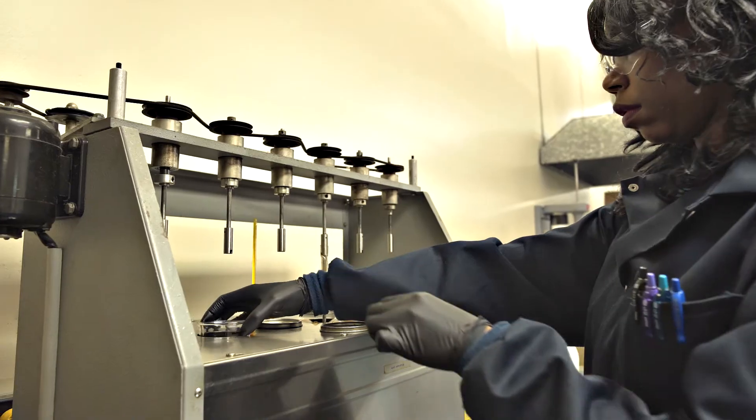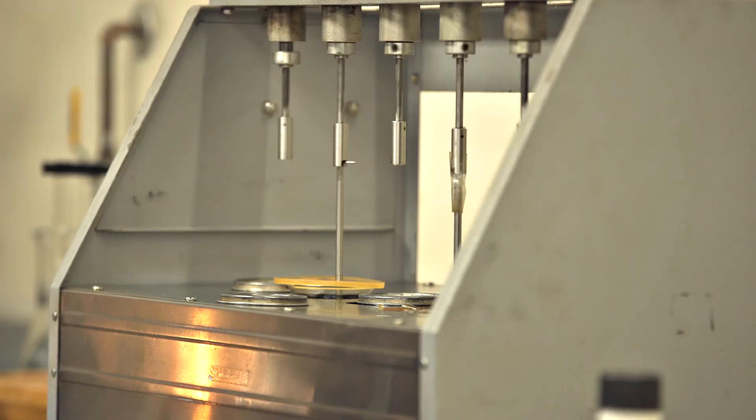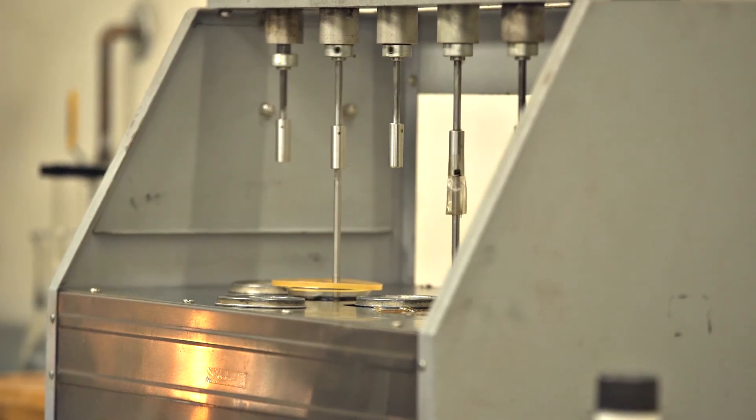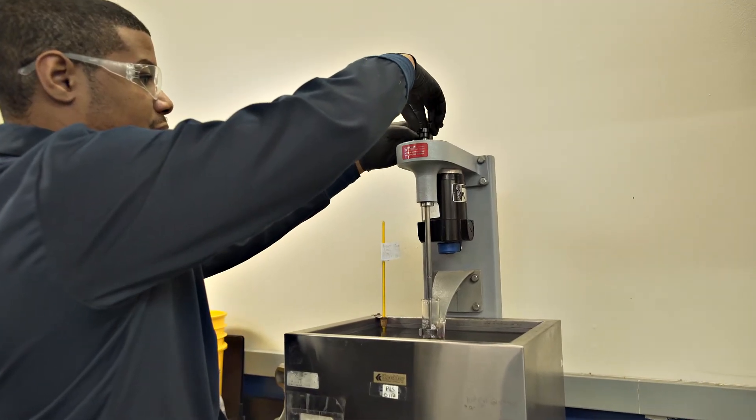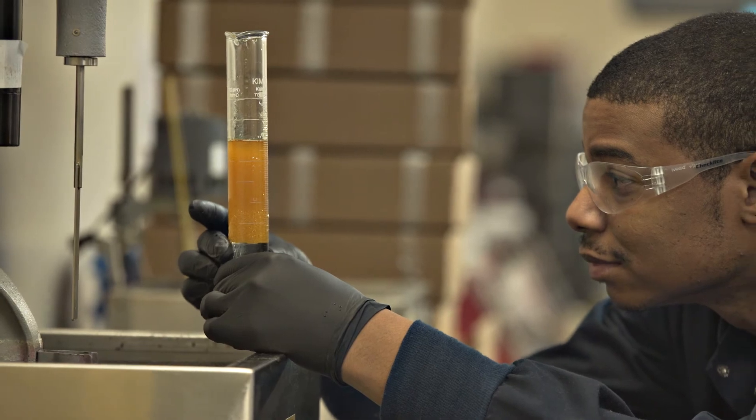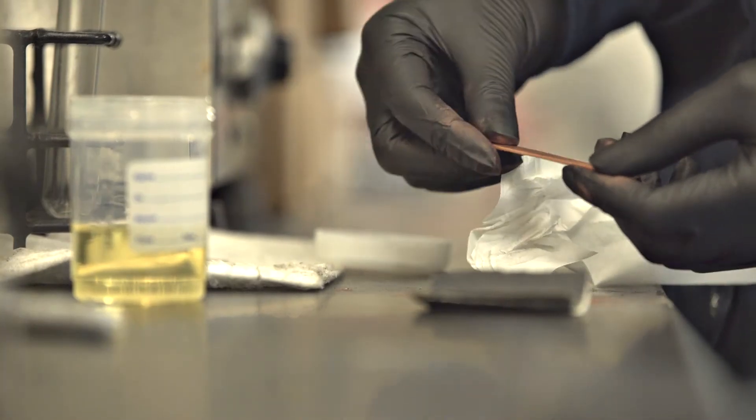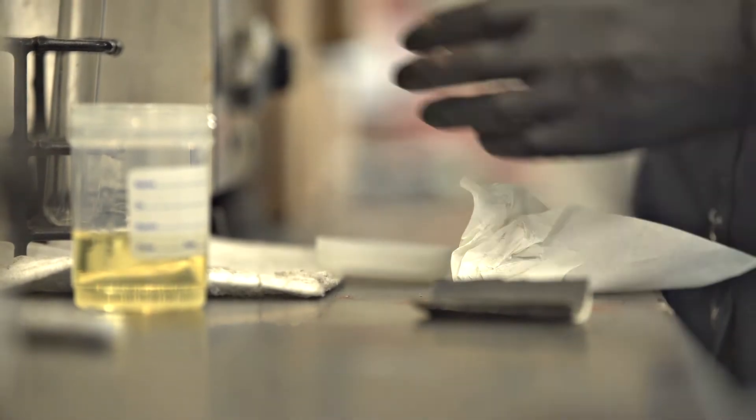Rust test measures for rust inhibitor performance. Water separability to ensure turbine oils readily shed free water so that it is not suspended in the fluid and carried throughout the system. Copper strip corrosion to verify corrosion protection.